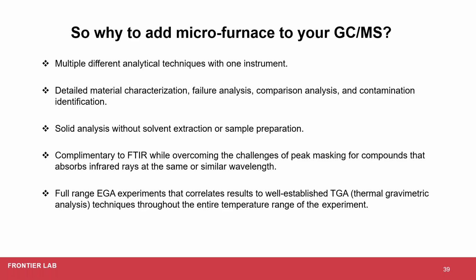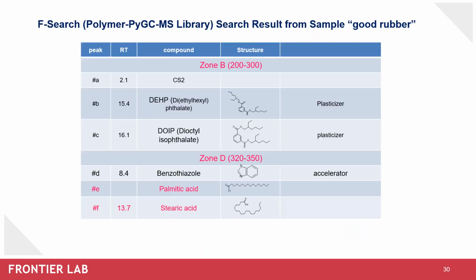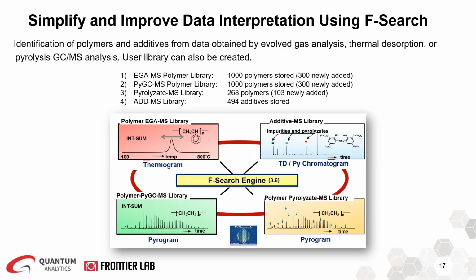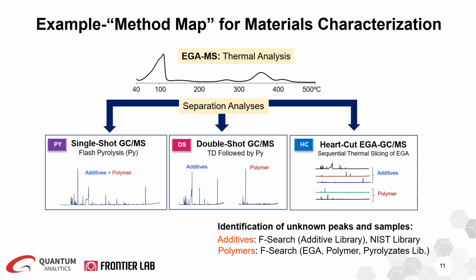And then I think this one is for you, Rogine. If you could go back to slide 11, it's regarding the double shot. Do you drop the sample back in to go from 300 to 500, or do you drop it down only after the furnace hits 500?